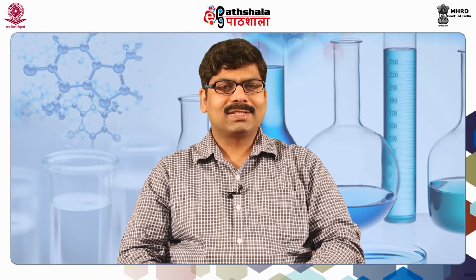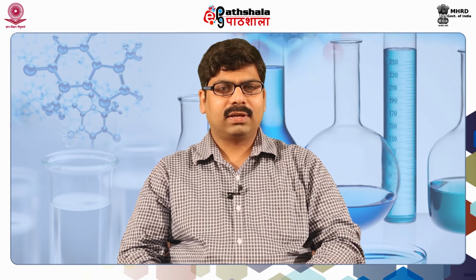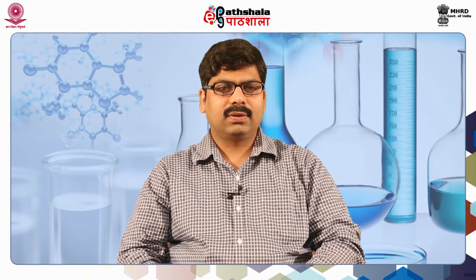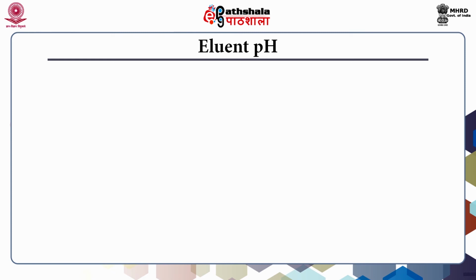Dear students, so far we understood the principle of ion exchange chromatography, types of ion exchangers and how to choose an ion exchanger. Let us discuss the pH of eluent that is used in ion exchange chromatography, the procedure of ion exchange chromatography and applications of ion exchange chromatography. Let us discuss eluent pH.